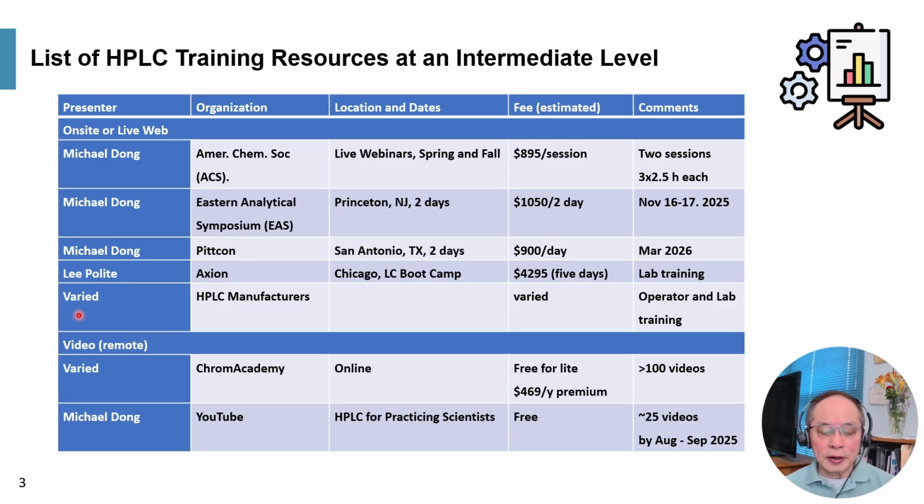Obviously, a lot of you would get operating training, lab training, or fee schedule training from the HPLC manufacturer, from the manufacturer you purchase your equipment. There are also remote video resources.